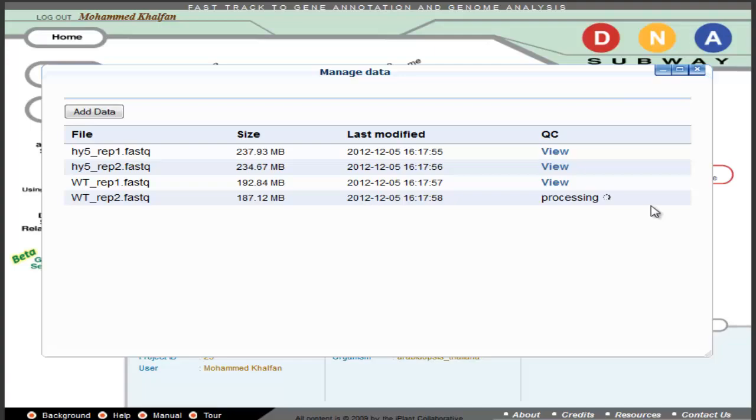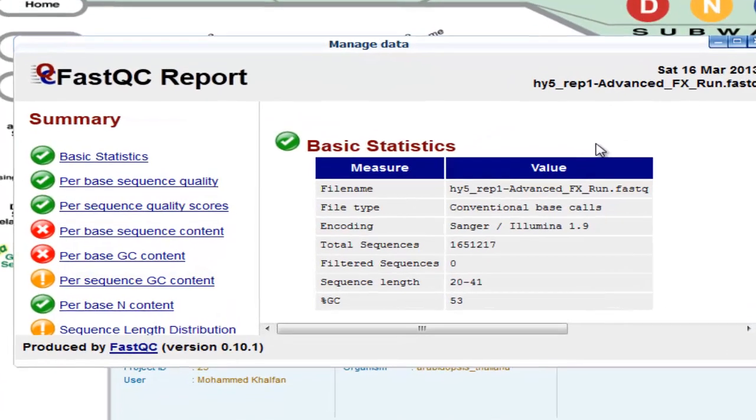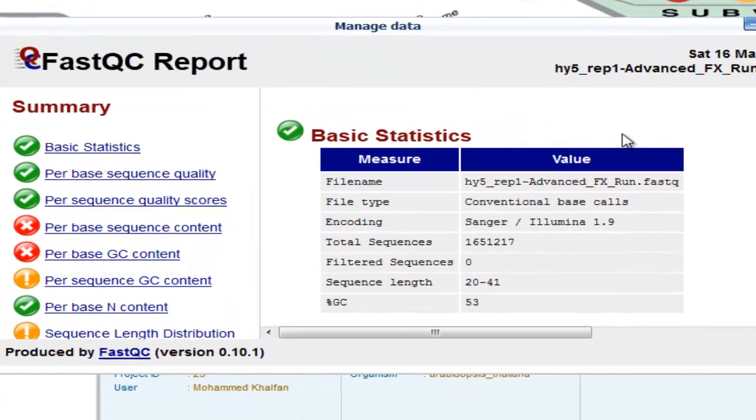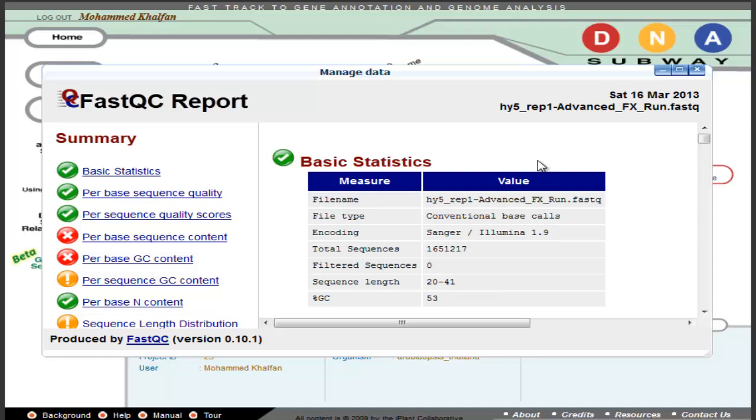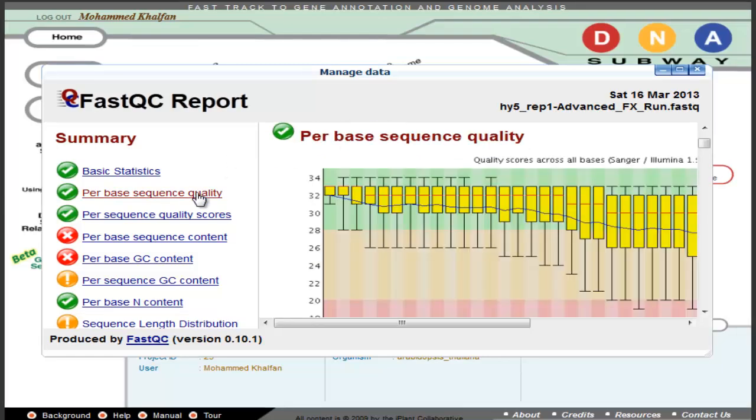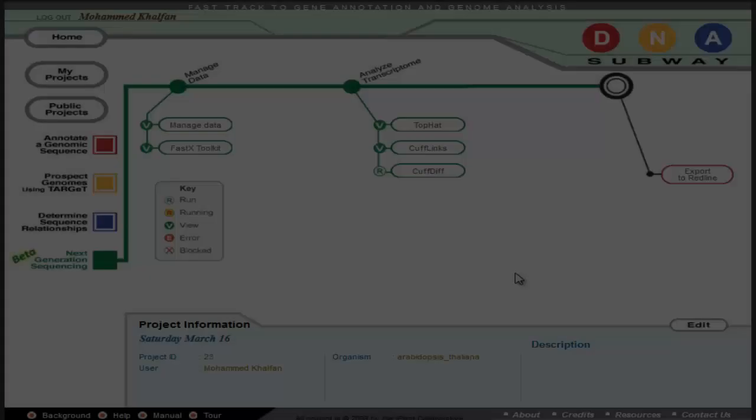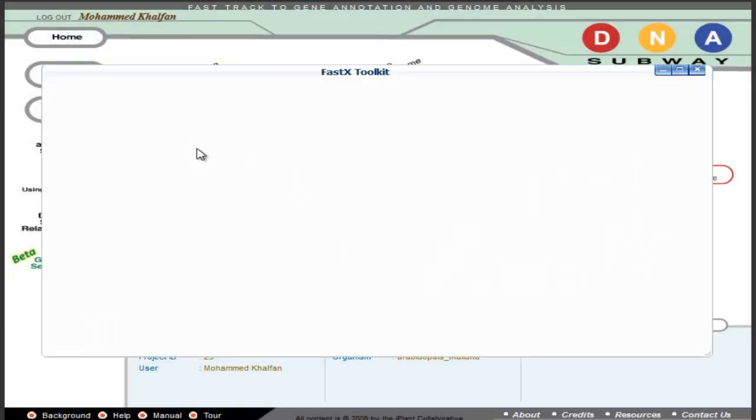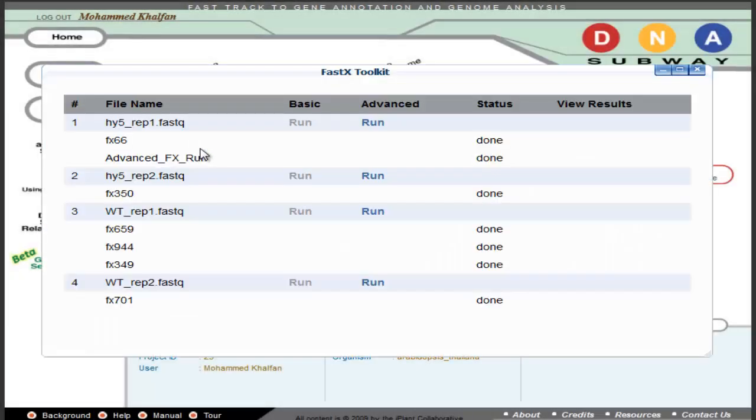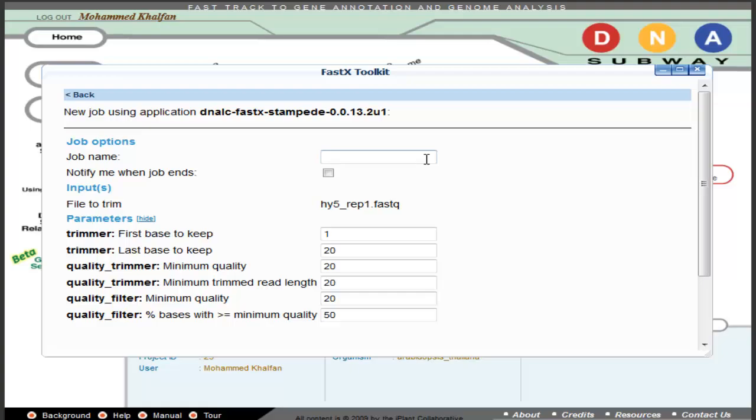Viewing the quality control results will allow you to see basic statistics in the form of a FastQC report. These reports will allow you to determine the quality of your data. Using the FastX toolkit, you can filter your data using defaults by running the file using the basic option, or under Advanced, you can choose to set your own parameters.